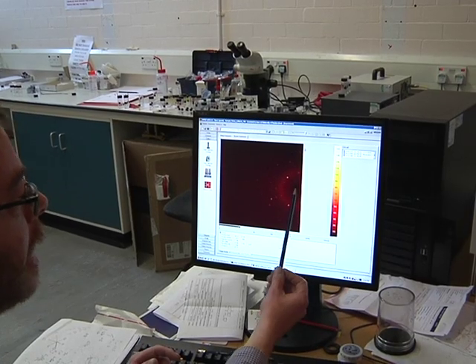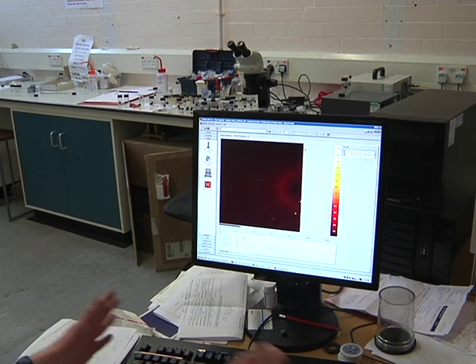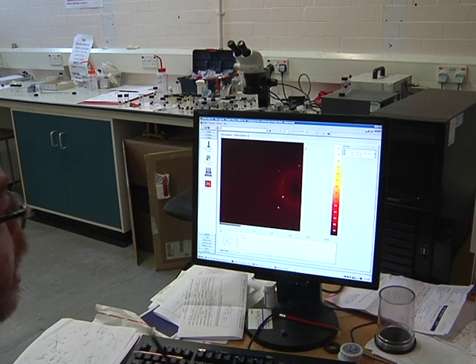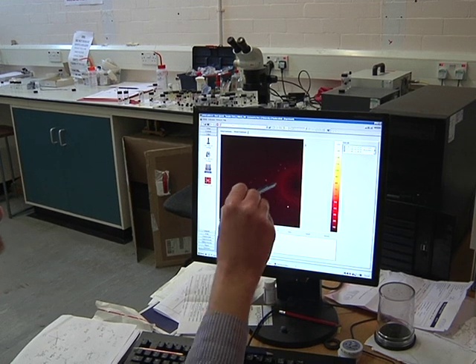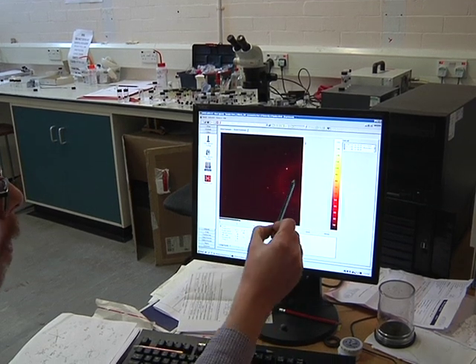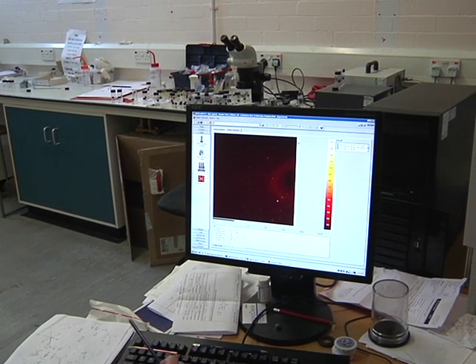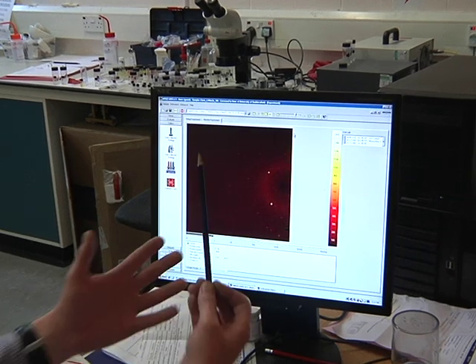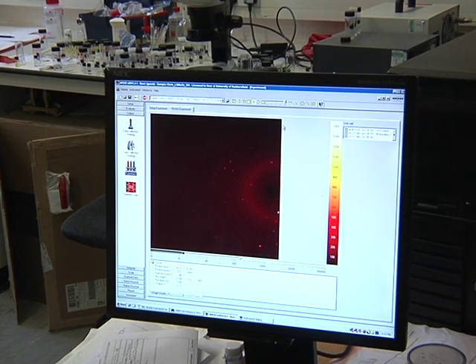This is the data we actually get out of all that experiment — all those x-rays and the camera. Effectively, our crystal is here. We can't see it, because we don't want to see it. But you see these bright spots here. Your x-rays come in and then they're diffracted, and these little spots here is what's diffracted. And if we measure each of these spots and backtrack, that's when we get our data out, that's when we get our structure out.